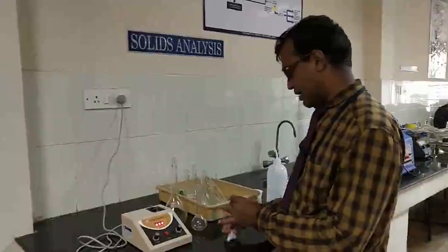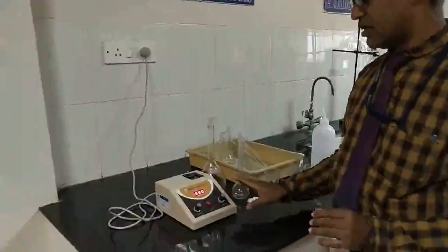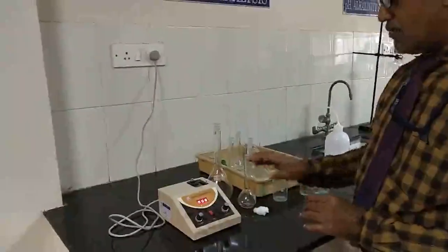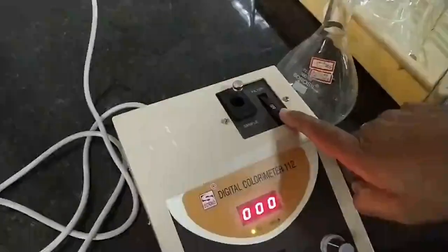Take that sample in a cuvette, but before that we have to calibrate the digital colorimeter by setting 0 and then setting 100. After calibration, you have to fix the wavelength by rotating the knob for the filters, that is 600.